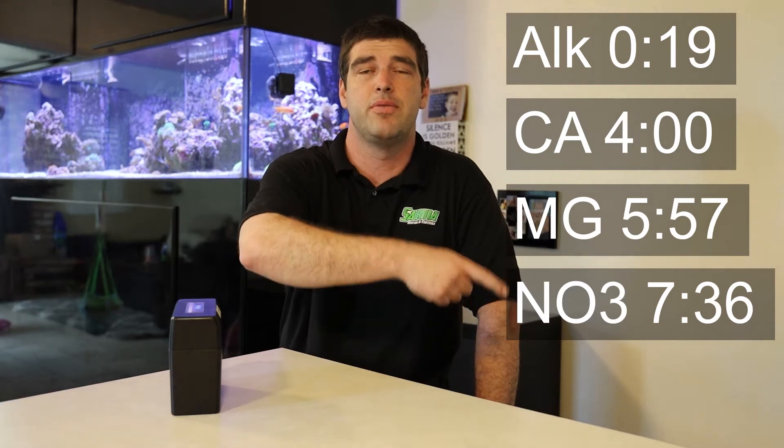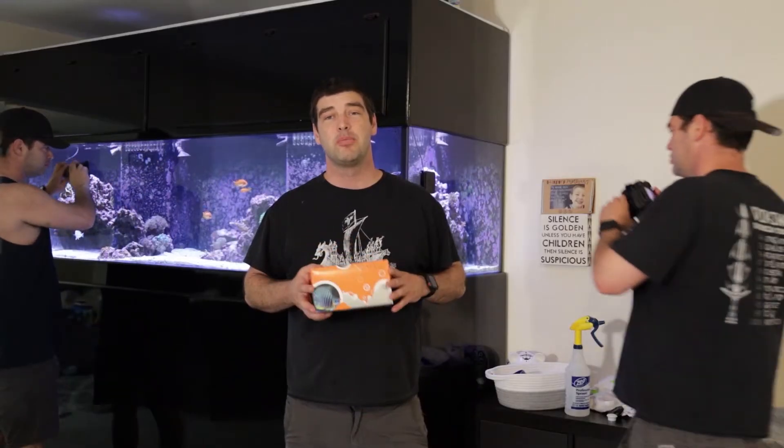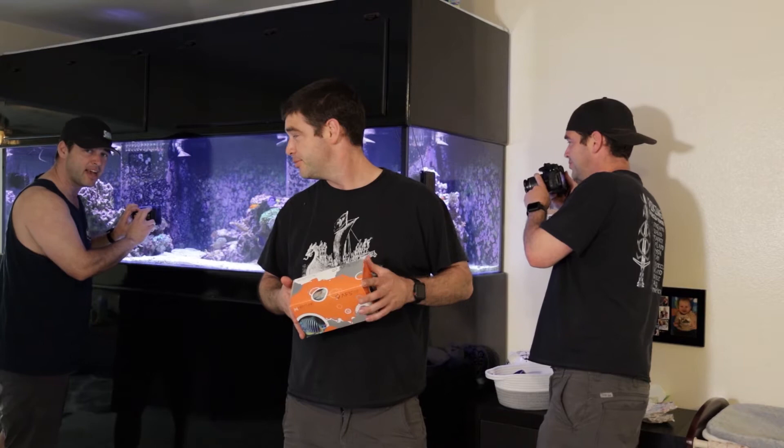Hello, today I'm going to be going over the Red Sea Foundation test kits. If you'd like to jump to these points in the video, you can see the corresponding test. Hello and welcome to Sabina Reefing where we go over product reviews and how-to's, livestock care and selection, maintenance and how-to videos.